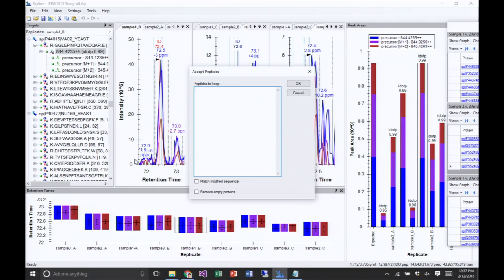And we're almost done here. So Control V to accept those peptides. People with me? Yeah? No? How far back are you? Well, my significant peptides didn't filter for significant peptides, so I still have 42 actually. So I don't know if that's right. 42 is what you want. Right, but how did you get the 22 then?